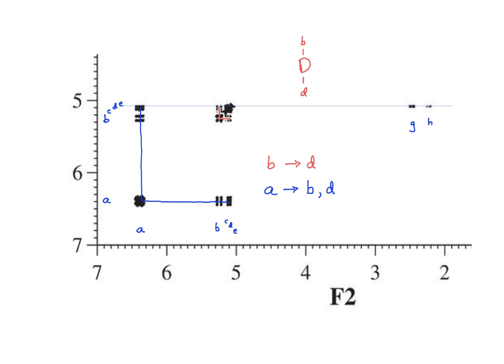And since we now know that proton A is correlated with B and D, and we earlier established that proton A was bonded to carbon B, we can claim that carbon B is bonded to carbon D. And then we can apply some logic based on the chemical shift of carbon D and the attached protons B and D, being consistent with an sp2 hybridized carbon D. If carbon D is sp2 hybridized, then there is not room for any other bonding pattern other than a second bond between carbon D and carbon B, assuming that there is not a long-range interaction between these atoms.